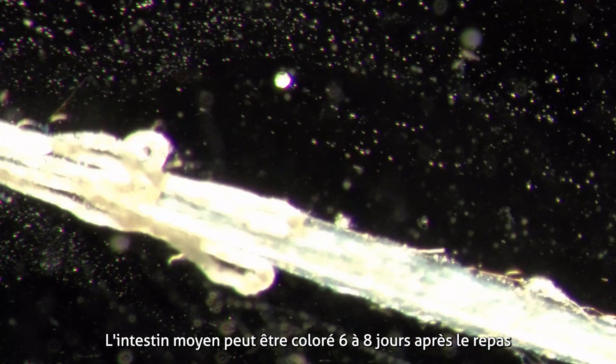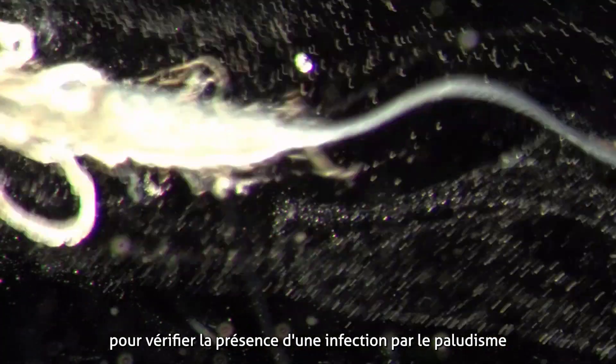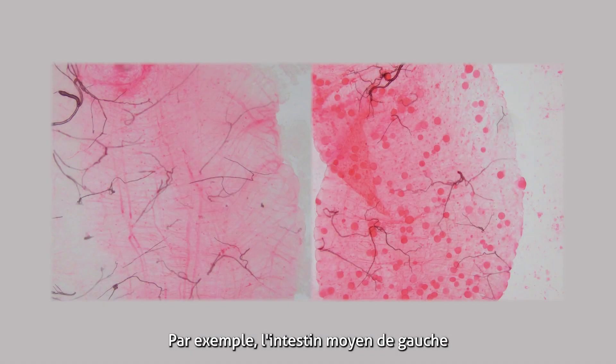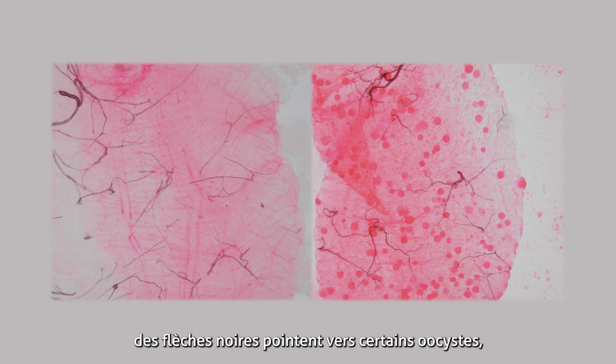The midgut can be stained 6–8 days after the feeding to check for malaria infection, and the oocysts will look like round dots. For example, the midgut on the left is from an uninfected mosquito with no malaria parasites. On the right, black arrows are pointing at some of the oocysts, indicating the mosquito was infected with the malaria parasite.